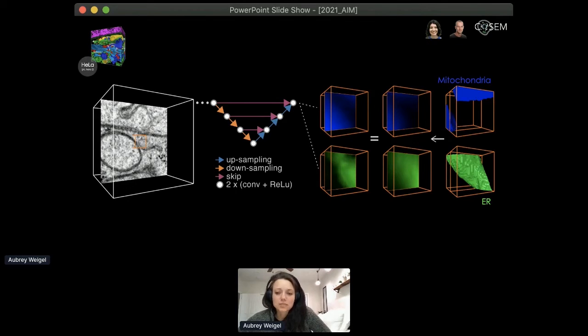To find the optimal setup, as well as the iteration for each label and the dataset, the networks need to be evaluated independent of the training data. We experimented with two different ways of doing this. The classic approach would be to compute metrics on an additional annotation, a holdout block, so acquiring a validation block that you could compare and make metrics against. This is very costly and it comes with its own problems.